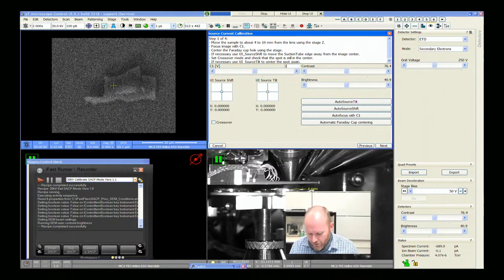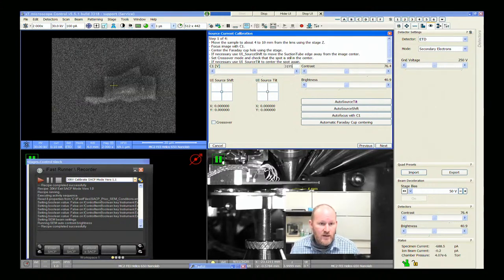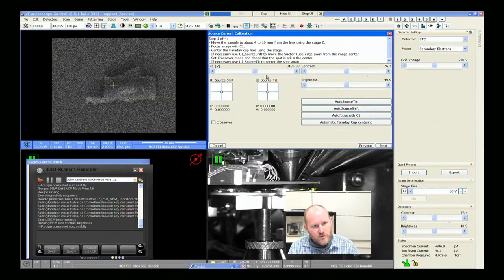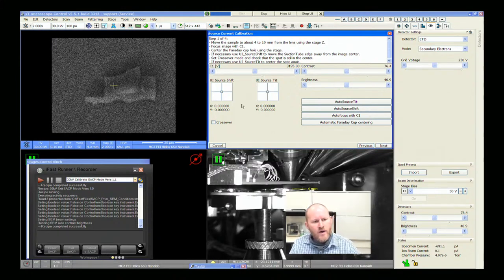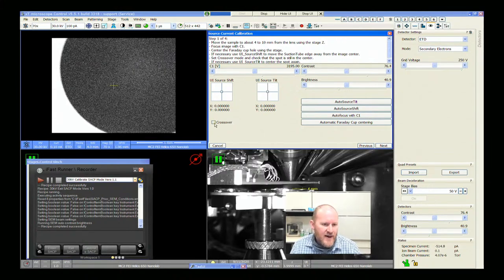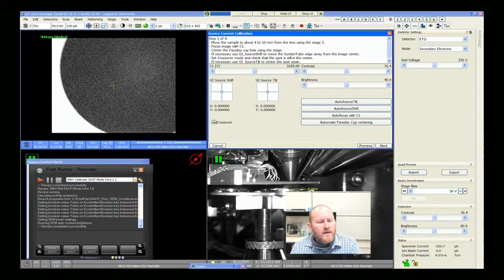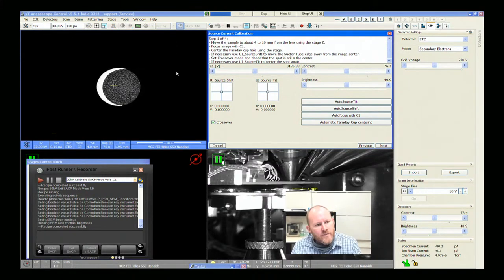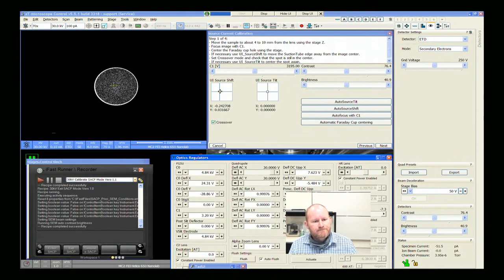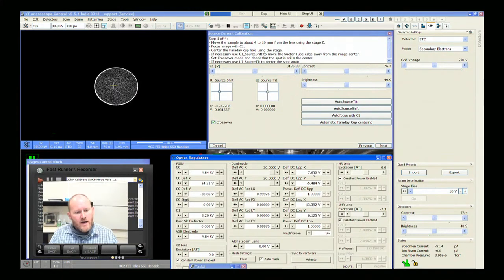Basically all you want to do at this point is write that number down so that we can put it into our calibration script. One other step I do here: the bright white is the edge of the pole piece bore. If I go into crossover mode in this alignment — I'm just doing a standard source tilt and shift. The DC values are changing: we're basically just pushing the beam around with the quadrupoles. What I do in this step is try to get the main image area centered on the edge of this pole bore, and also get that centered around the yellow cross using source tilt.